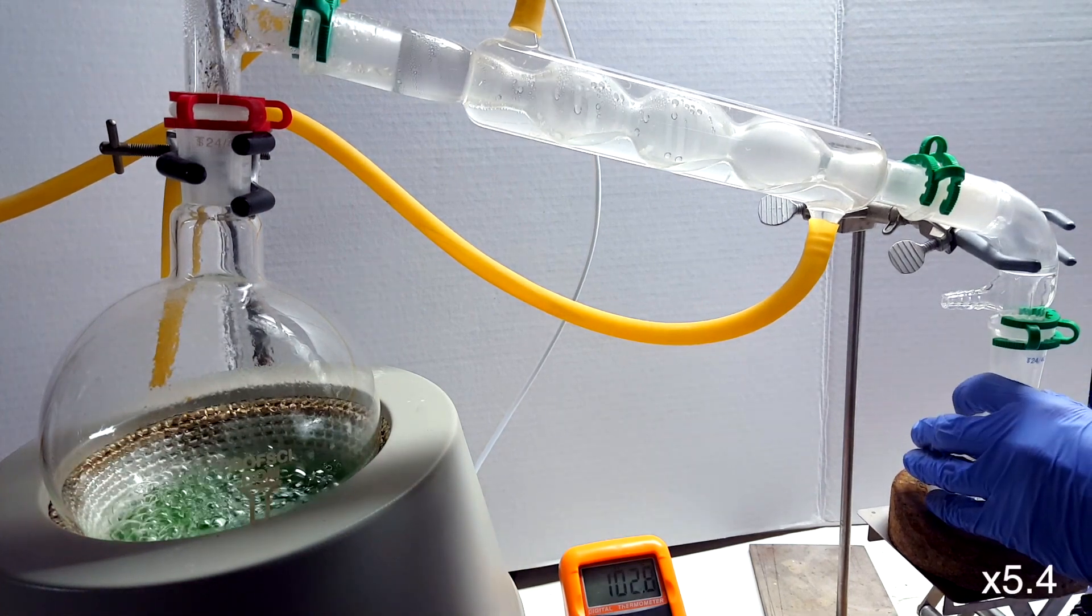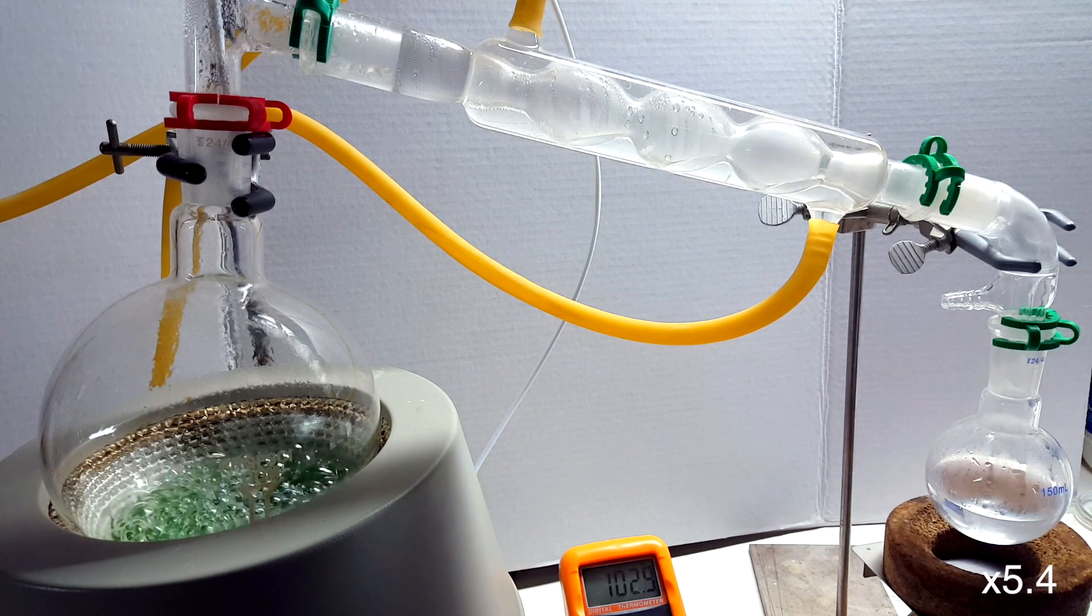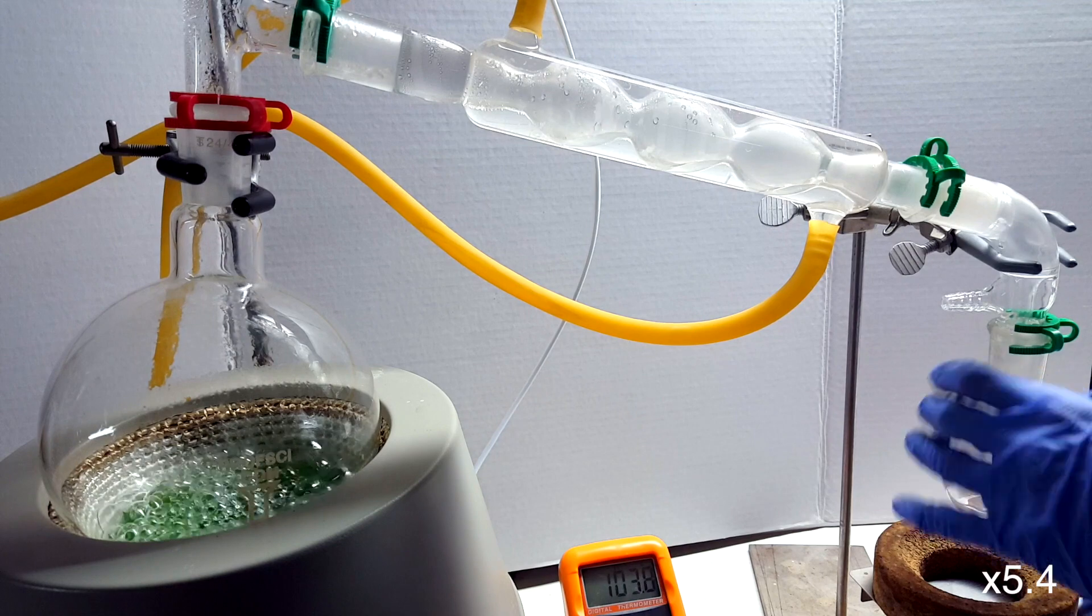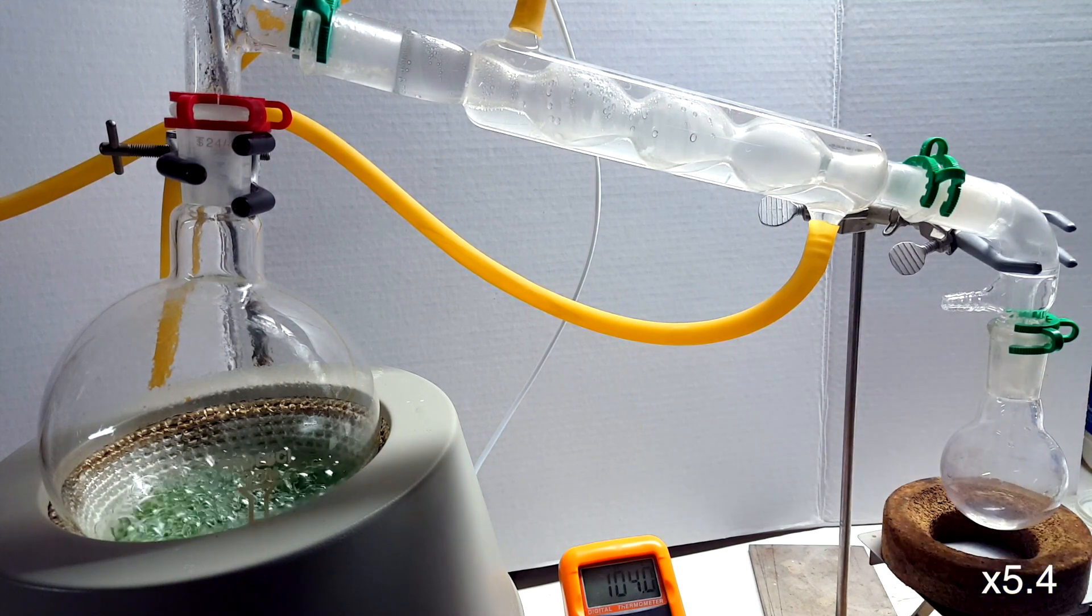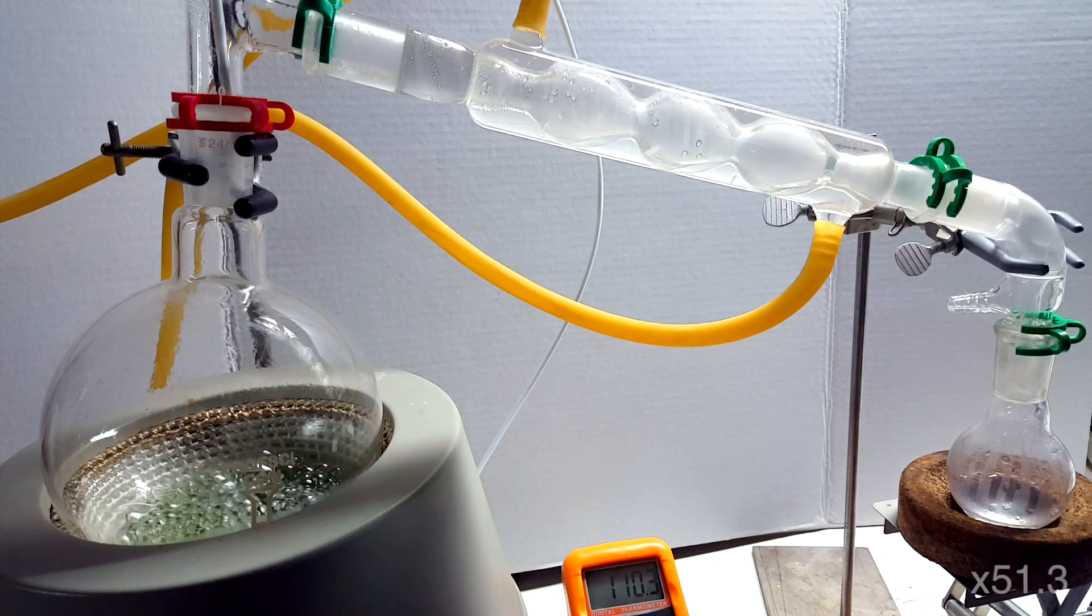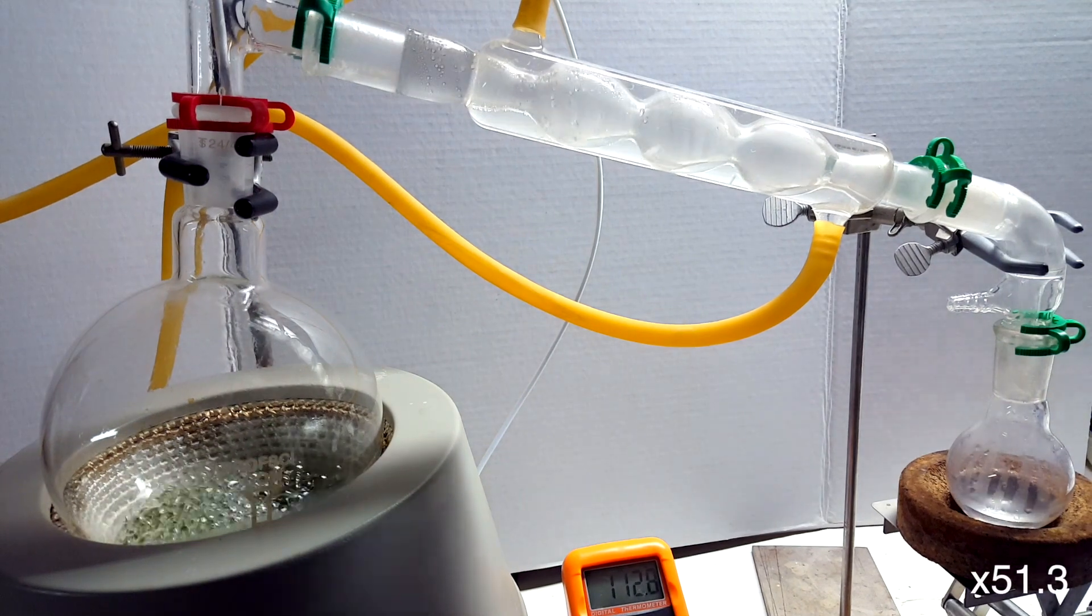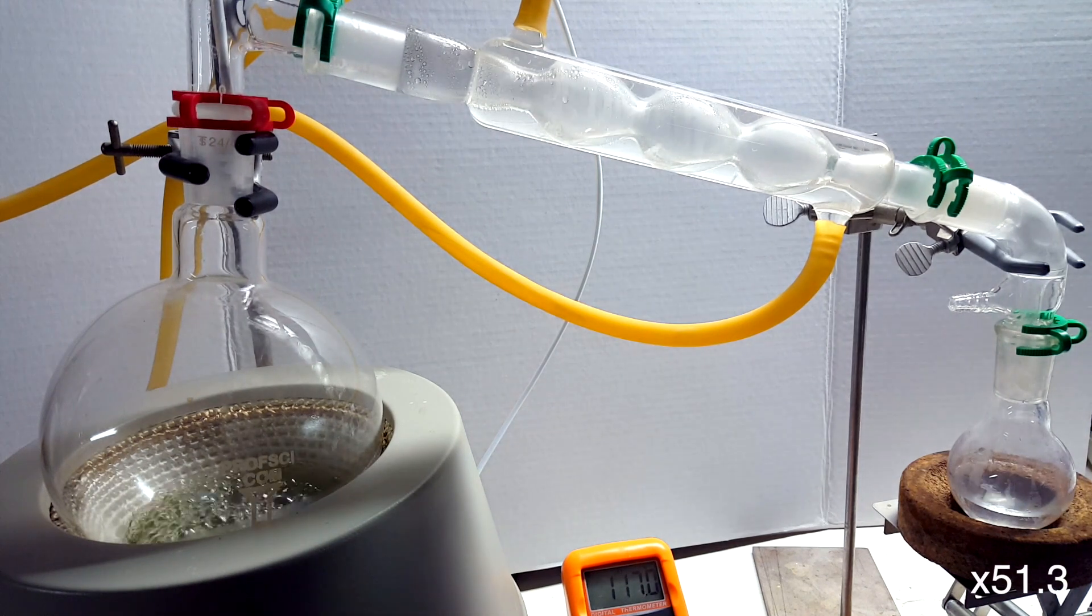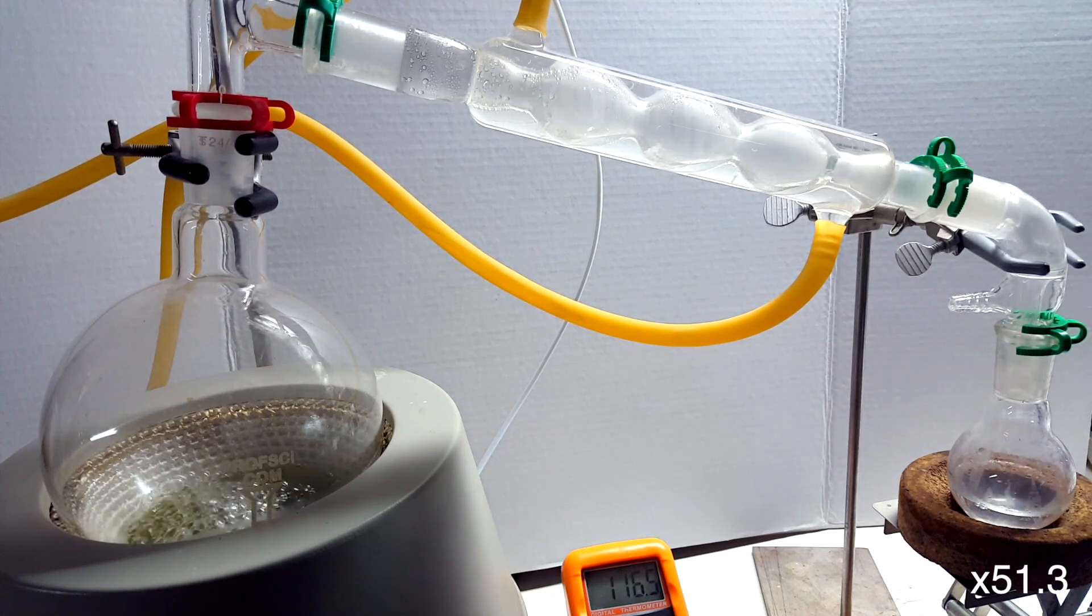Soon enough, the temperature began to rise past 102°C. So, I decided to switch out the receiving adapter. Past this temperature should distill over dilute phosphoric acid, which is useful in some experiments. The temperature increased to 117°C over the course of about 45 minutes, and the distilling solution progressively became darker and darker.